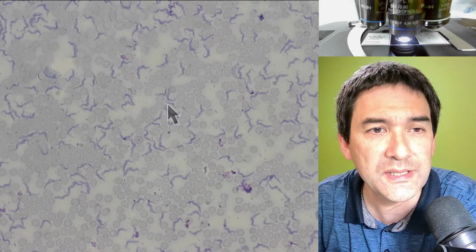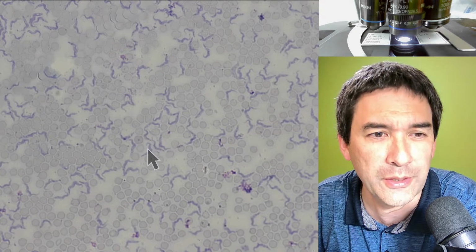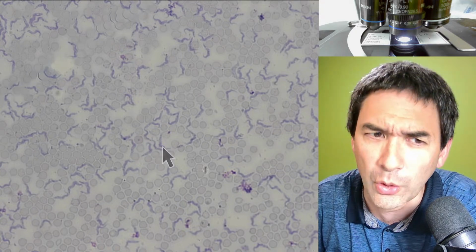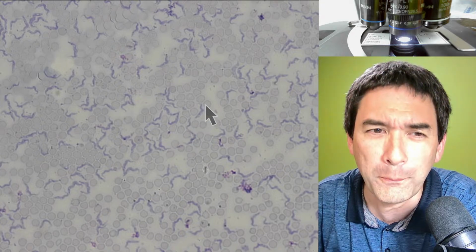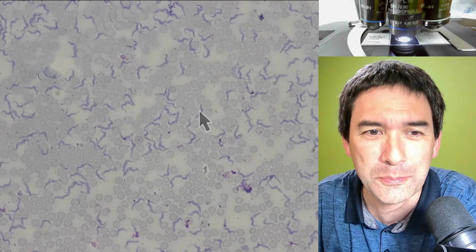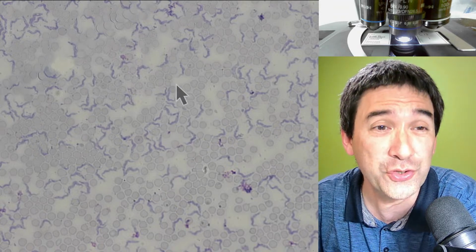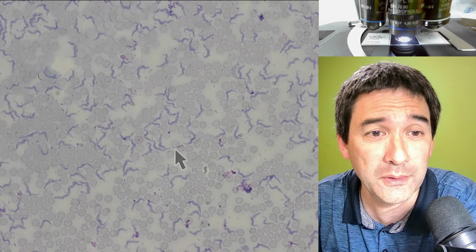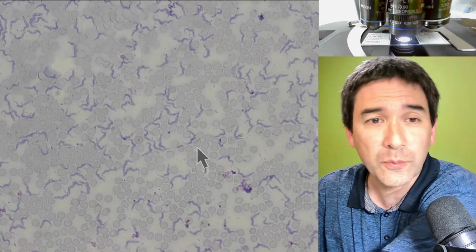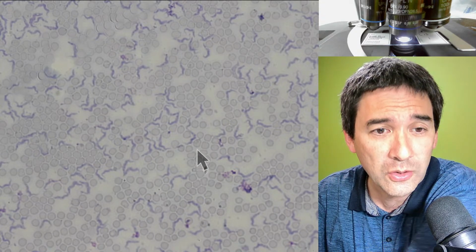Okay, so when I saw this slide the first time, I said, wow, there are a lot of them here. Now, I don't know if this is actually a natural blood sample or whether the company who made the slide did not actually reproduce them and grow them inside blood, because the concentration of these trypanosomes is crazily high. But this also shows a little bit that with proper staining, you're able to make them quite well visible.